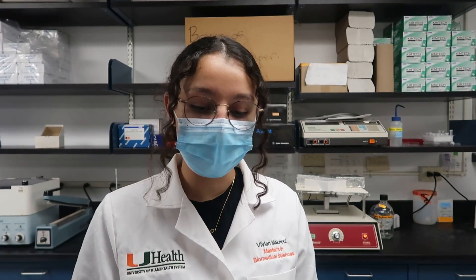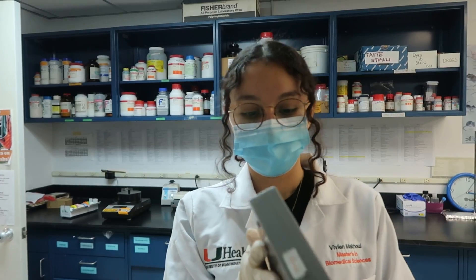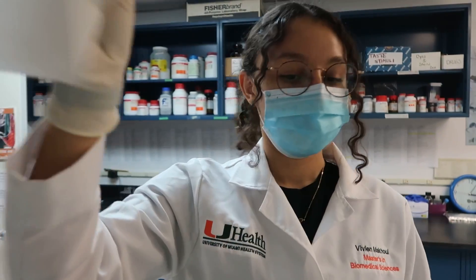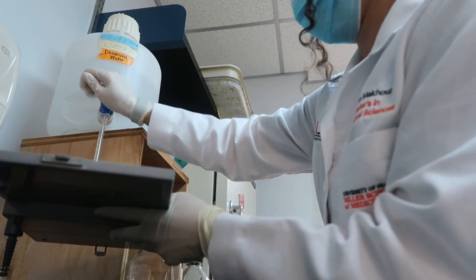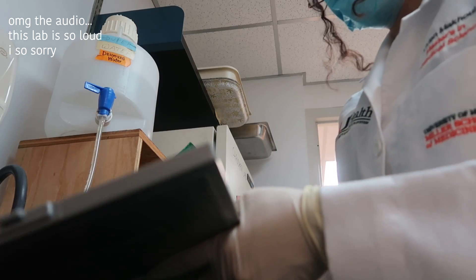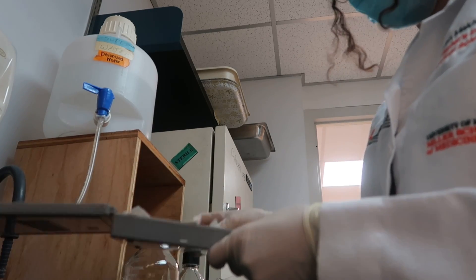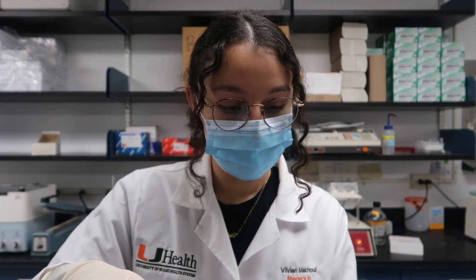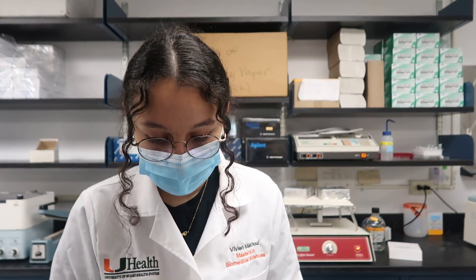I'm so happy — it's two o'clock and I'm already putting this in. Okay, we're going to make a humidified chamber. You're fired. Gotta get it real silky, real wet up in there. About the excess. Now, without messing up — and for my next trick. I did mess up quite a bit.